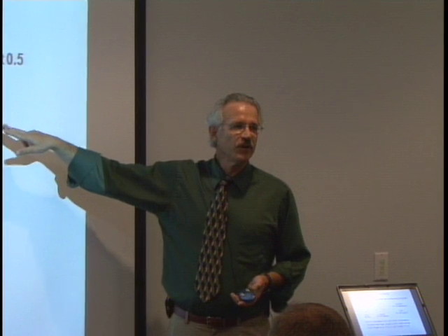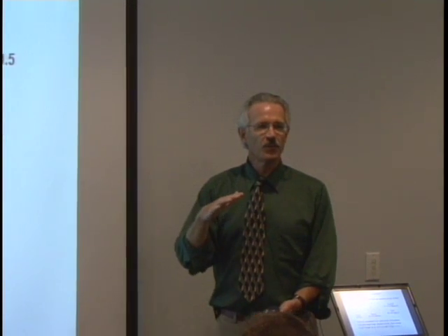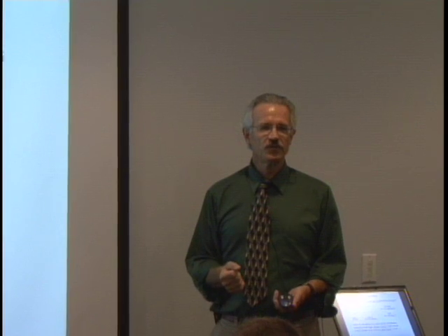So by default, the limits that you put on possible compositions allow you to specify the number of rings and double bonds in a molecule. And you'll see that the default value is below 0. This is the reason. There's one more thing. If you have non-covalent complexes, then the number can even go more negative because you don't have just standard valence for that sort of thing.